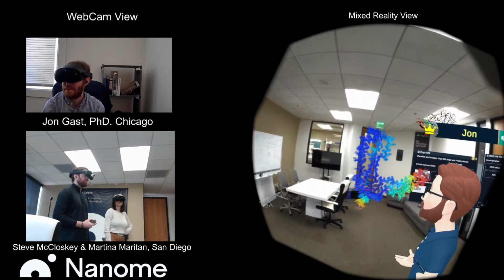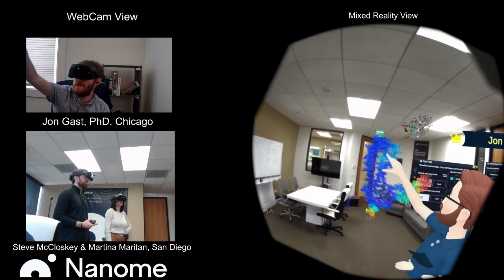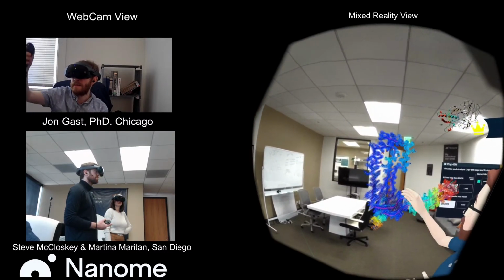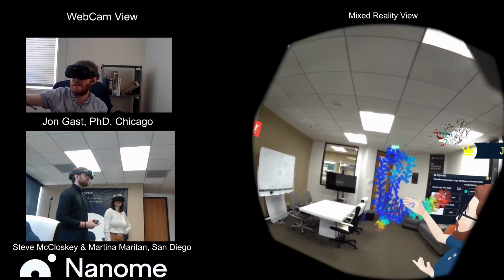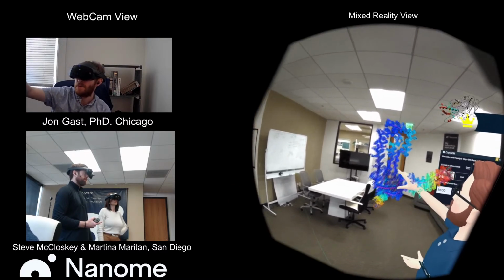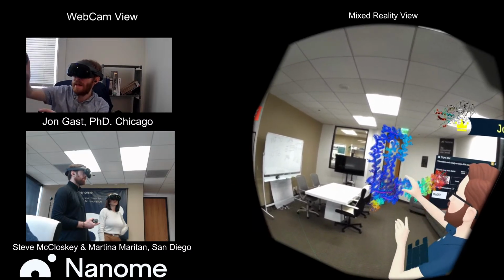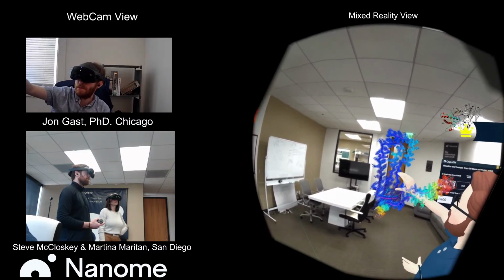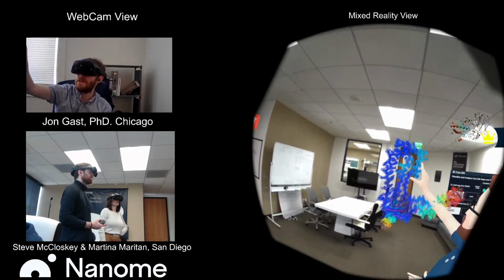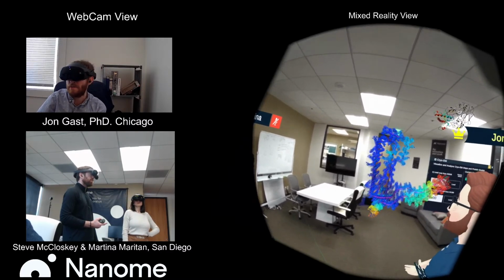Wow, that's a great question. So overall, the big reason that it needs to be a plugin is mostly because of how the surface is being rendered and calculated. Plugins exist in a space in between Nanome and how it's going to bring in other data. In order to interpret the map, we don't have anything built right into Nanome that analyzes cryo-EM maps. So the plugin's job is to take the data within that file and produce this surface within Nanome, that we can then visually use and understand.